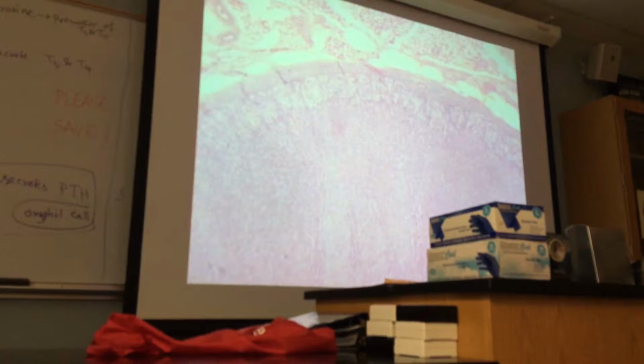Thyroid gland, you should have. Can you tell me why you remember adipose tissue so well? Because it is unique. Because of its uniqueness, isn't it? Why is thyroid gland unique? Because of colloid. So you never forget. Do you get that?